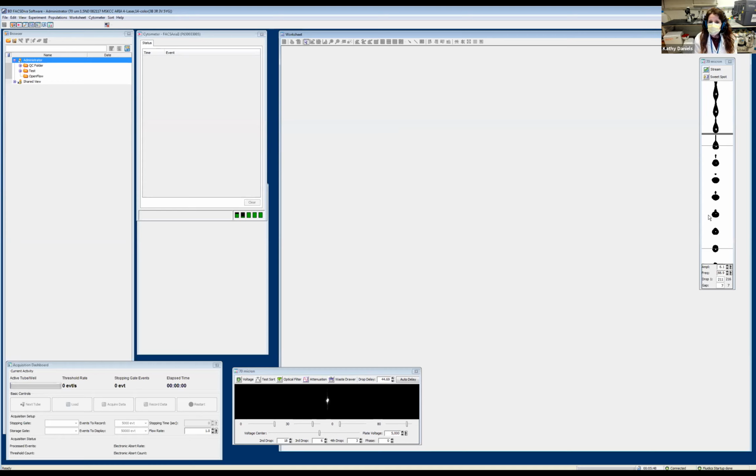Okay. So as Derek mentioned, it's very important that we make sure that we QC our instruments, right? So what we do every day is we make sure that the optical alignment of the instrument and the performance of the instrument is as expected. That is something that we have carried out today, so we're not going to review that at this point, but it's important to know that that optical configuration is optimized for the performance of the instrument.